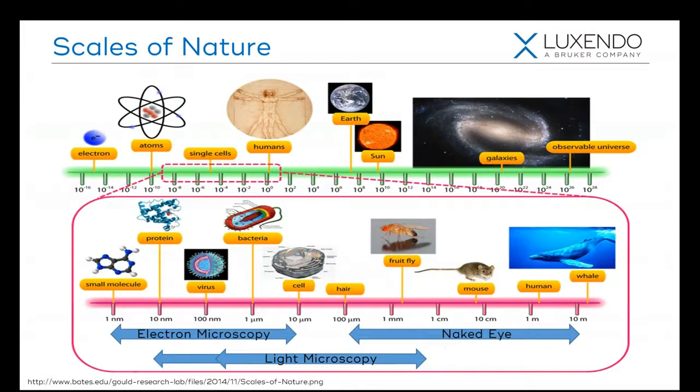And about the same time, there was another push in order to image things in a more physiologically relevant context, such as inside whole organisms or in 3D cell cultures. And in this push, we saw improvements in laser scanning technology, really the peak of spinning disk confocal, and the rebirth of light sheet microscopy.